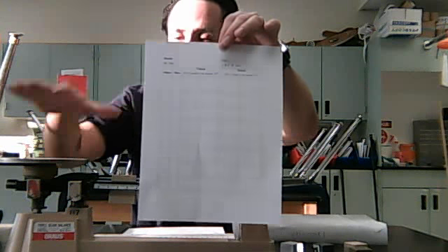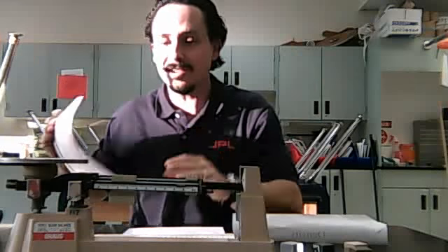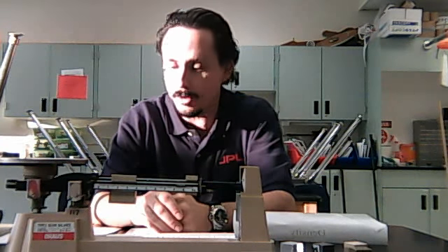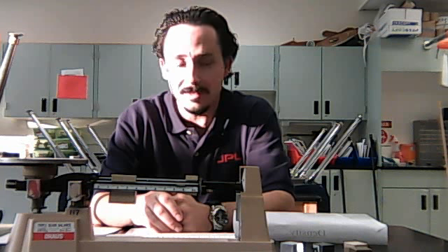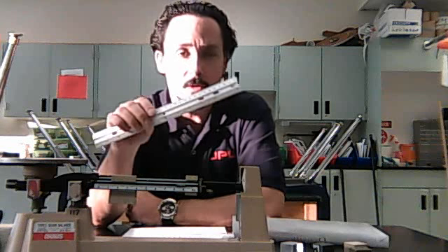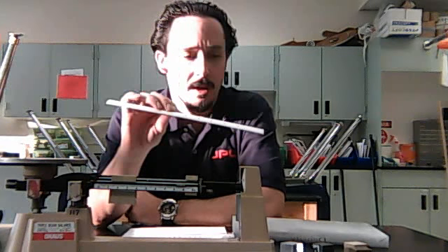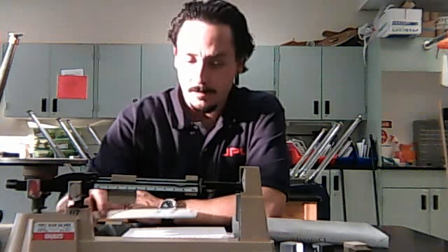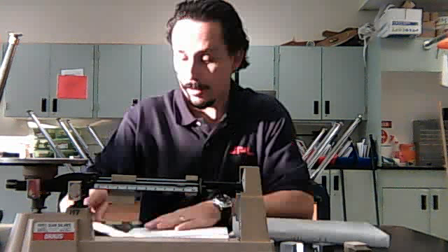Then you're going to use the triple beam balance to find the mass. So we're going to work on that skill a little bit. Make sure that you're very accurate to the nearest tenth of a gram in order to be able to compute the density at the end. Once you're done finding the mass, you are going to use a metric ruler following the 3 rules that we talked about when you measure length to find the length, width, and height. Multiply those together to find the volume. And you're going to round that answer to the nearest tenth also.